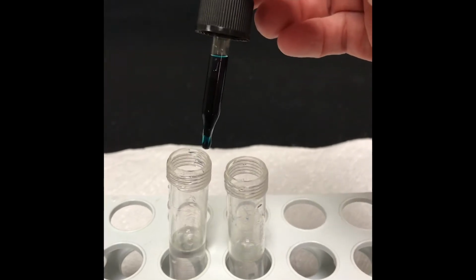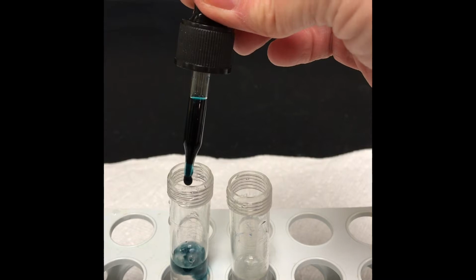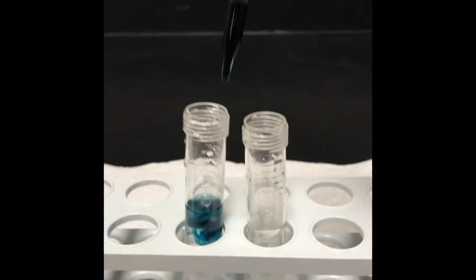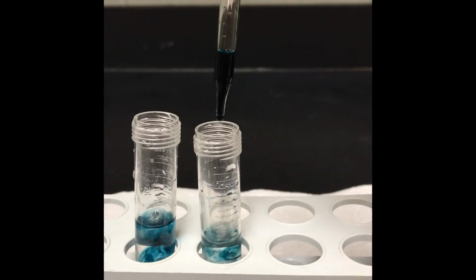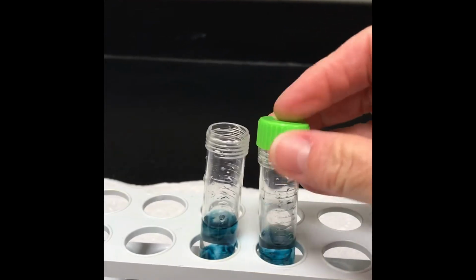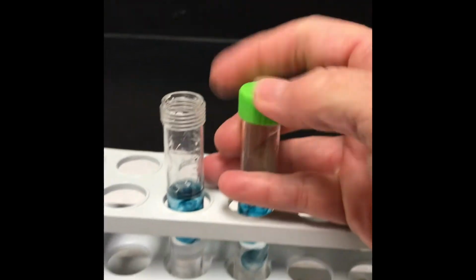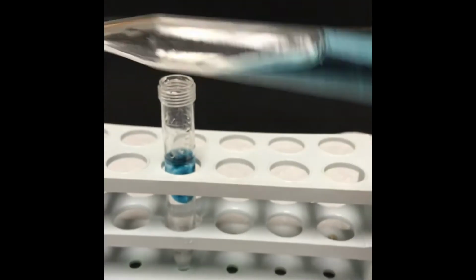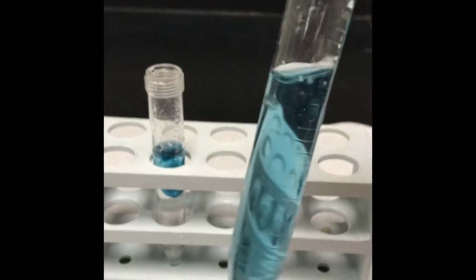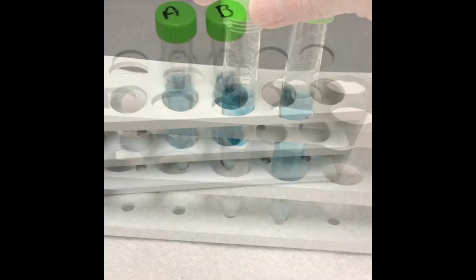So here's the bromothymol blue. You can see it in the dropper bottle. So we're going to go ahead and add 1, 2, 3, 4. Beautiful diffusion right there, right? 1, 2, 3, 4. And we want to make sure that it's diffused all the way. So I'm going to put the cap on this. And then, look how cool that is. Invert it a couple of times and make sure that the bromothymol blue is all the way in there. Okay, so there you go. And I'll do the same thing to the second one.